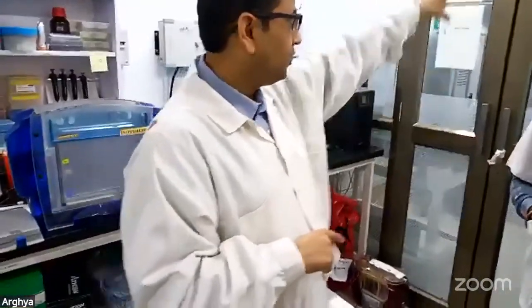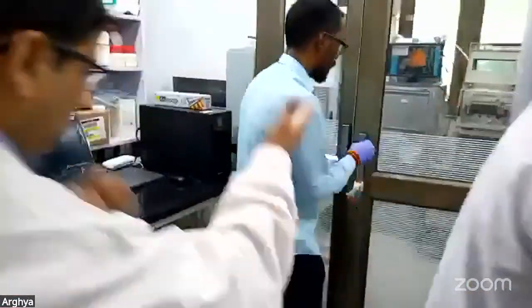So then you have to come to mass spec. Now there are different types of mass spec which can be utilized, but right now if the goal is only to identify the protein, very simple, all you want to know is what that protein is, then you can simply go to a MALDI-TOF instrument, which can very quickly and rapidly tell you the identity of the protein. So the next demo we are going to have is on the MALDI-TOF. Let's first show the instrument, then we come back to it.